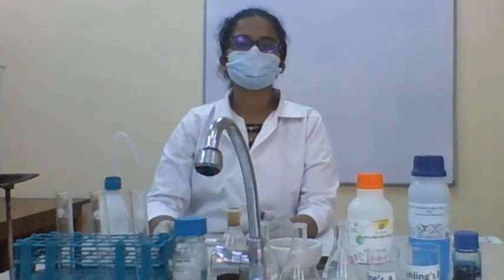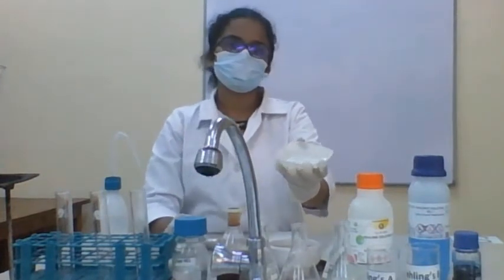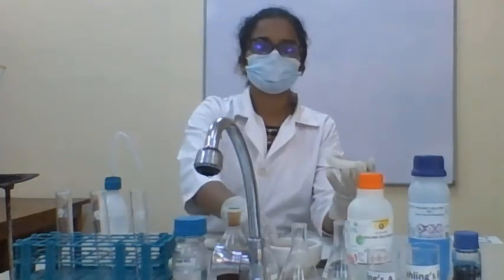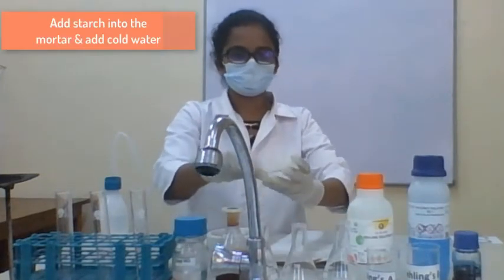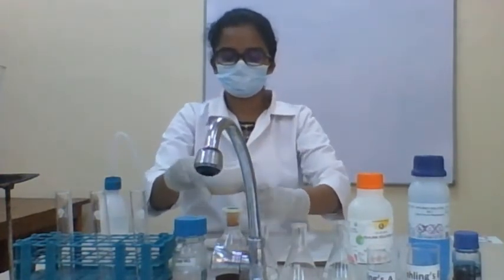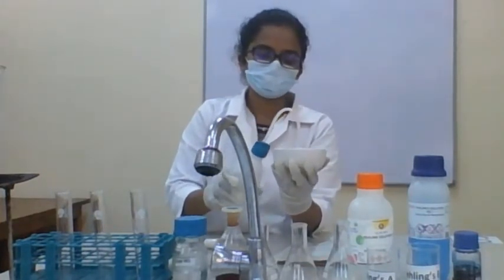Today our practical is hydrolysis of starch, and for that we have already measured 0.5 grams of starch. First we are going to add it into a mortar, and I'm going to add a small amount of distilled water.